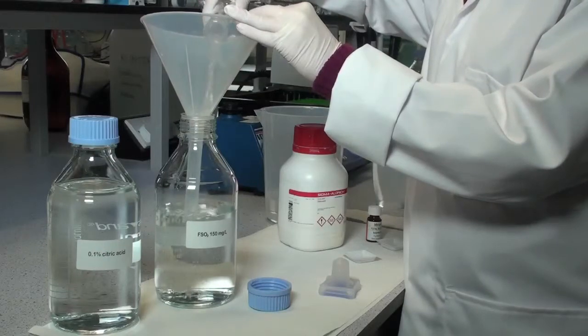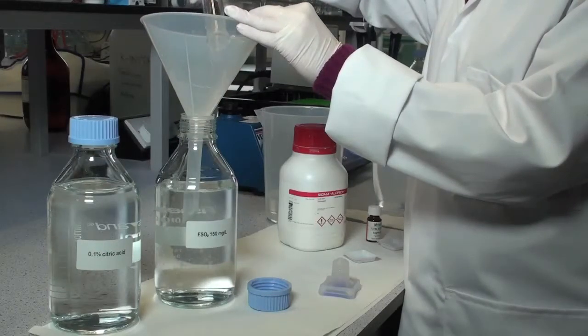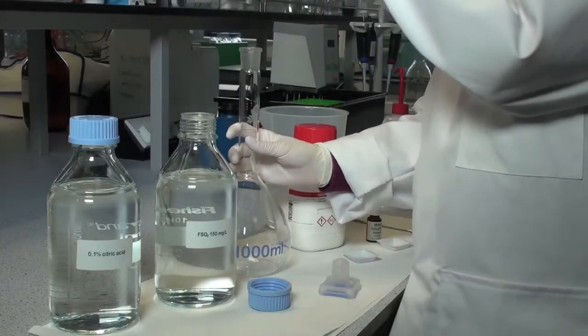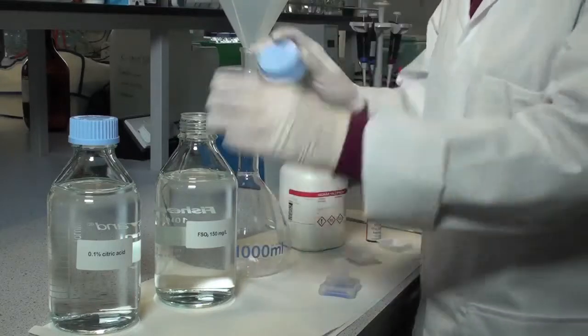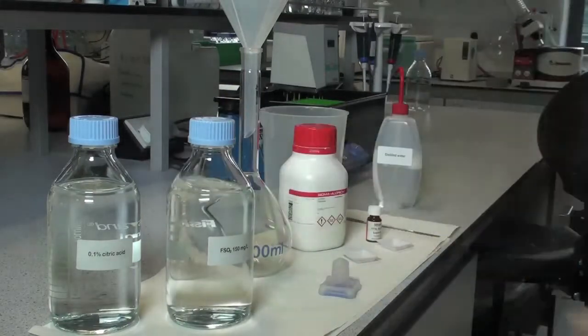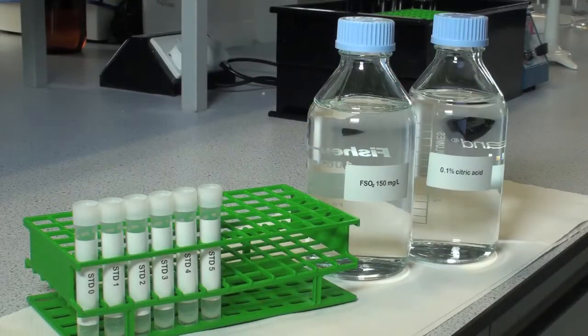In order to prepare the Free Sulphite Calibration Curve, this requires this solution plus a solution of 0.1% Citric Acid. The 150 milligrams per litre Free Sulphite solution and the 0.1% Citric Acid solution are used to prepare the individual Free Sulphite standards. The relevant volumes of each of these solutions used in the preparation of the individual standards are detailed in the following table.